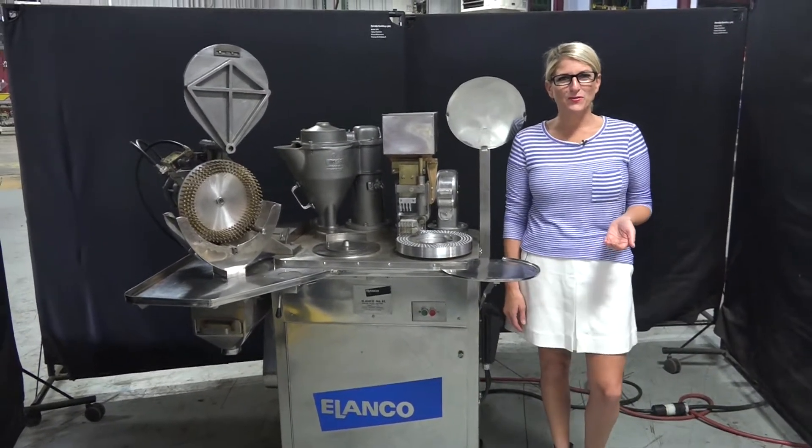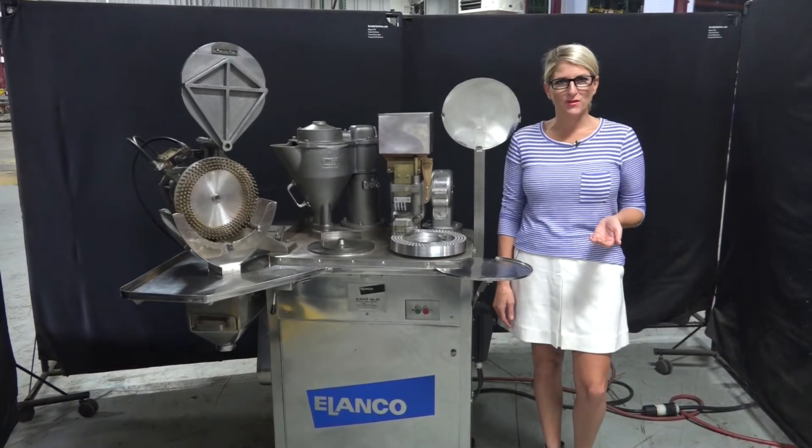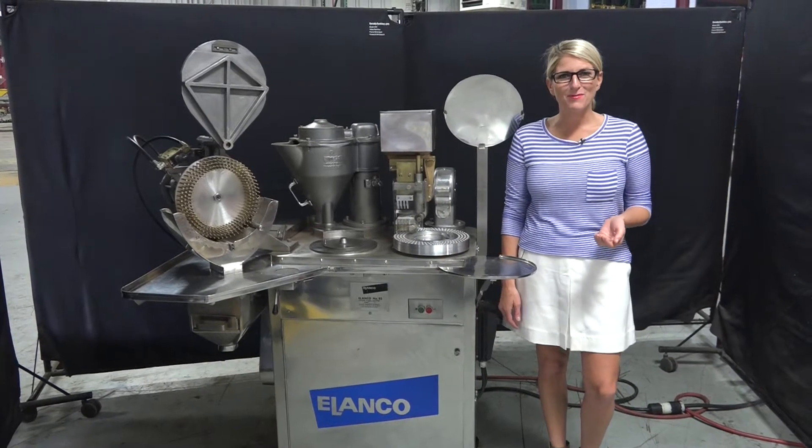Hi, I'm Katie with the Frame Group. Today we're cycling your Elanco Semi-Automatic Capsule Filler. We recommend you read the manual in its entirety before powering up the machine.